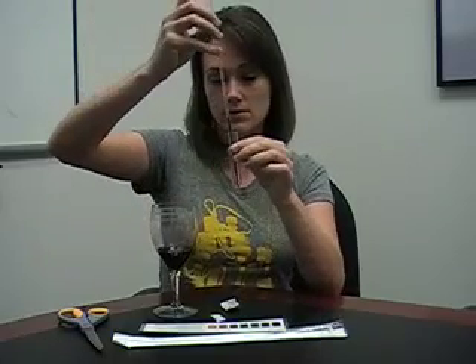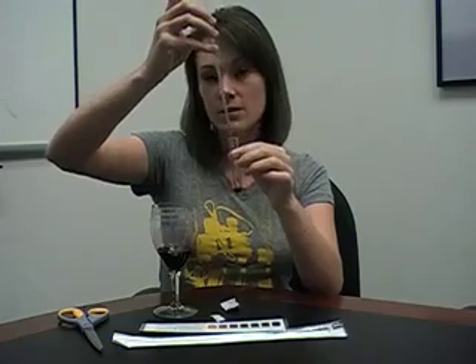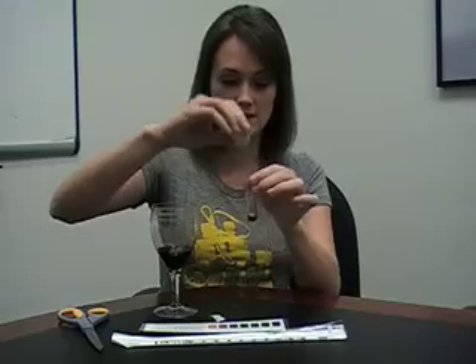Now you want to add the sample to the test tube, at the bottom of the test tube. You want it to be a 0.5 milliliter sample because the amount of wine in the sample really does affect how the outcome of the test comes out. Then take your Clinitest tablet that we so conveniently cut open already and just drop it into the test tube.